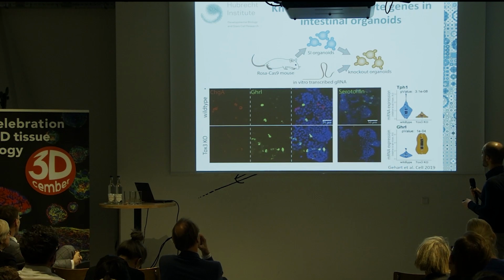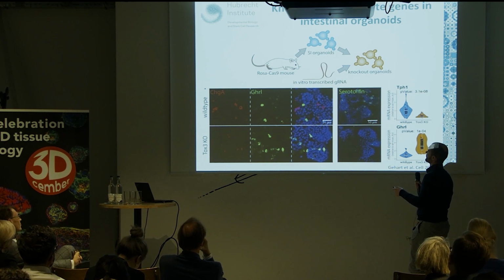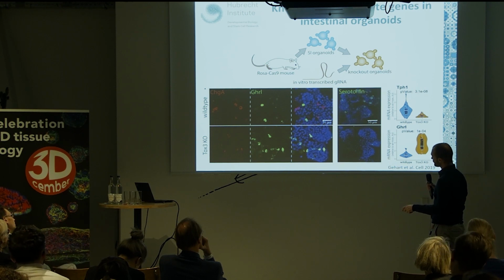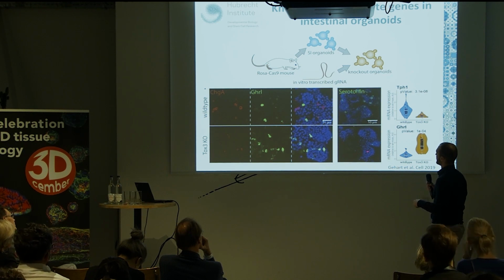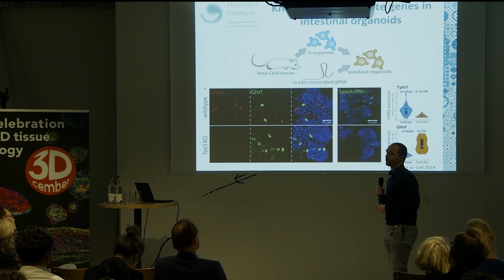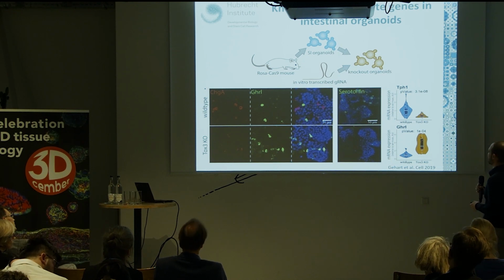So in the end, we used this to knock out 9 candidates that we identified. Essentially, we used organoids from a ROSA-Cas9 mouse, in vitro transcribed gRNAs, selected clones that had the desired knockouts, and then tested enteroendocrine differentiation. This is just one example, where we knocked out TOX3, which causes an increase in X cells but a loss in enterochromaffin cells. So in total, 6 of these 9 candidates that we chose gave us beautiful enteroendocrine phenotypes, which I think is, well, a very, very good argument for the quality of our data set.